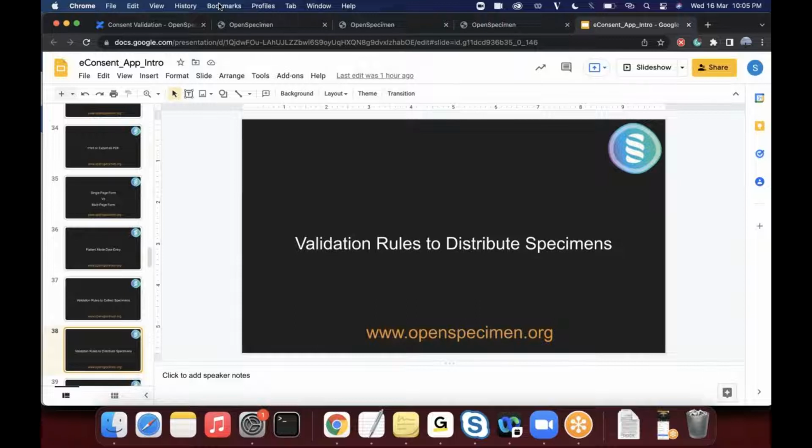Yes, so the integration, again, all these are API based, as standard with the rest of the OpenSpecimen system. So specific integrations can be built. There is no default integration that we have done so far for any CTMS, and not just for consent. Encore is one thing that someone at Emory had done, again not in the context of consents, but the answer for all integration is always yes, because we have the APIs, and it's pretty straightforward to develop any kinds of integrations.